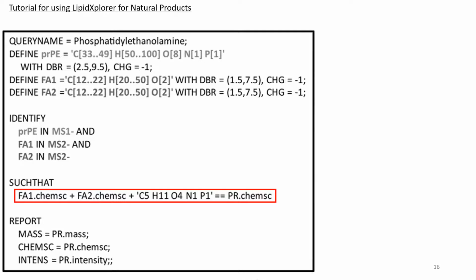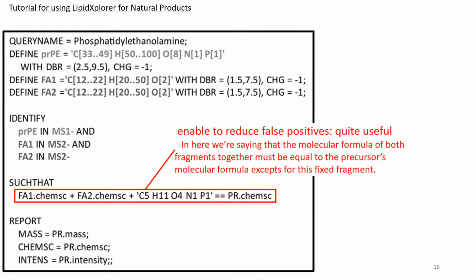So this third part enables us to reduce false positives. This is quite useful. Here we are saying that the molecular formula of both fragments together must be equal to the precursor's molecular formula except for this fixed fragment.